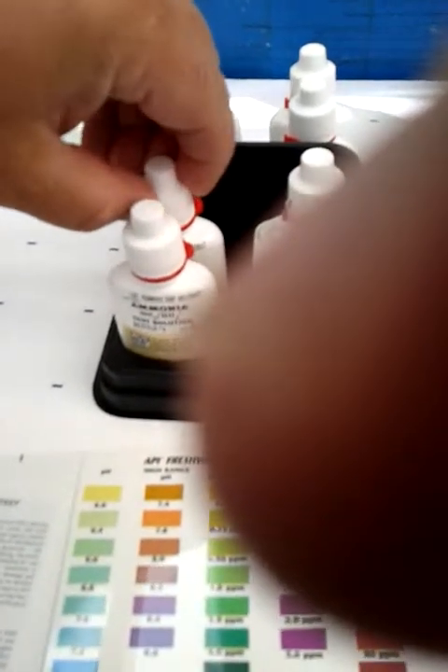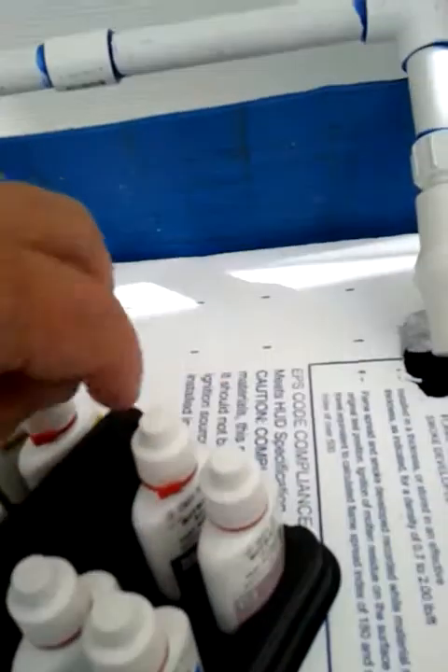So I've done an ammonia test and I also did the high range pH test. Now I've got to do a nitrite test and a nitrate test. The nitrate is a two bottle solution.